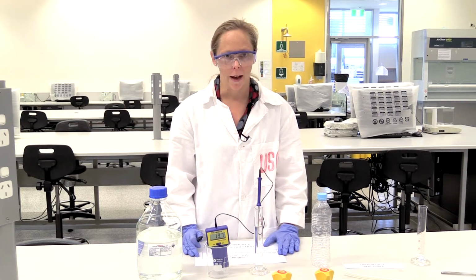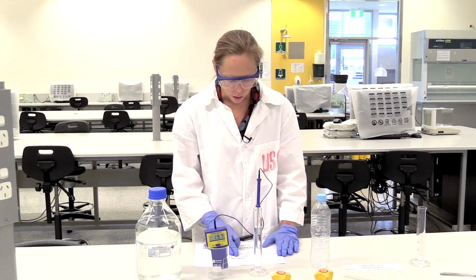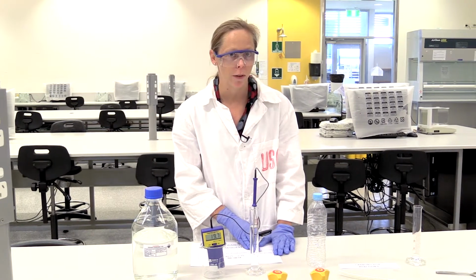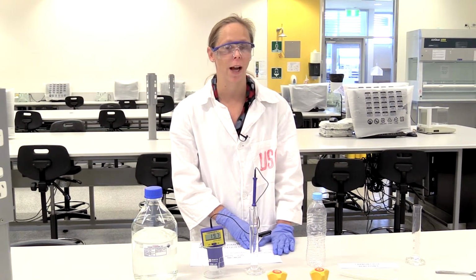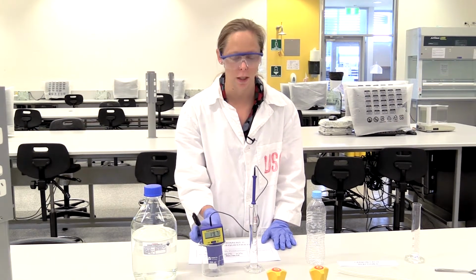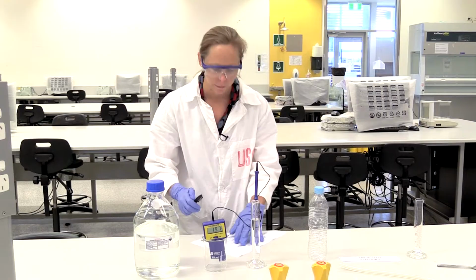So what we want to do now, so we've seen that we've got an endothermic reaction for our carbon dioxide production. So now we're trying to see if we've got the same or different for a carbon sequestration reaction. So if we could just read off the initial temperature of our sodium hydroxide. 19.7.